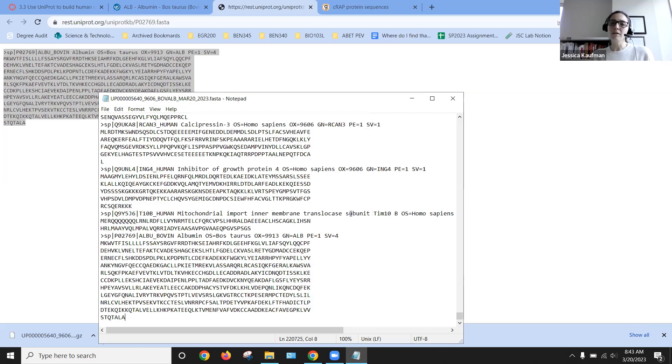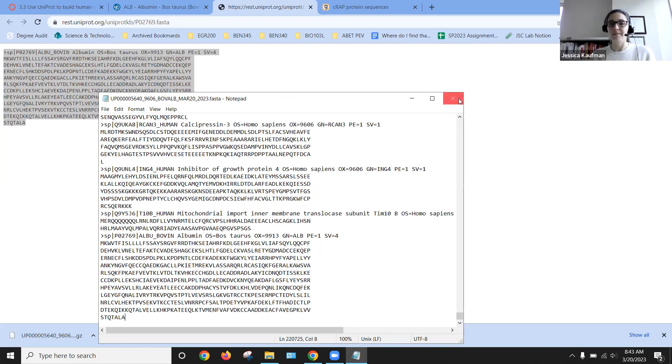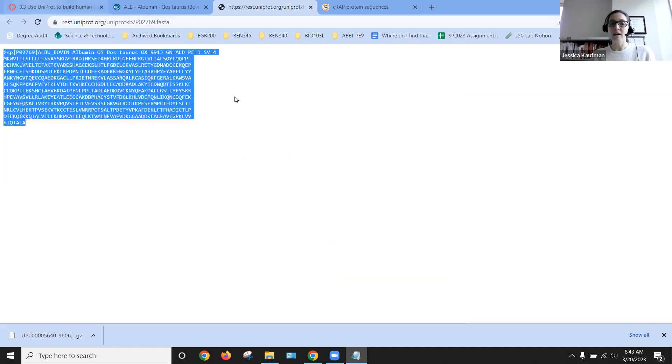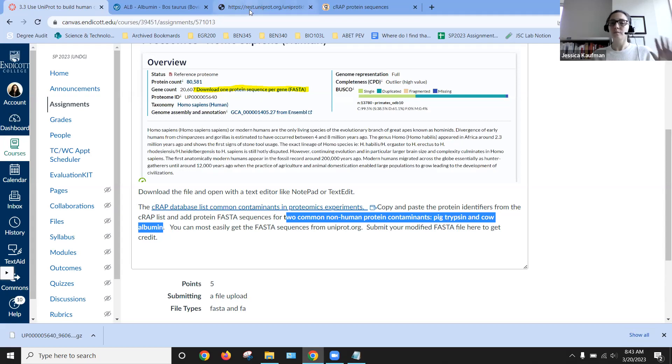So now we'll know this isn't just the human proteome. This UP number that represents all of the proteins in humans also contains bovine albumin. Once I have my file updated with both proteins, you'll want to also add porcine trypsin. Then it's ready to upload to Canvas.